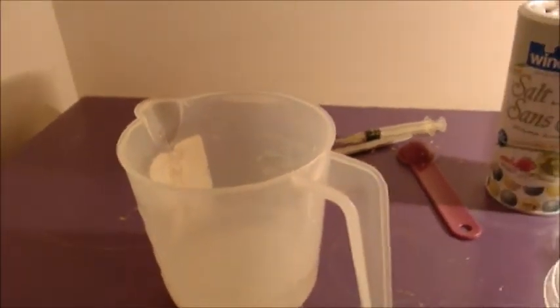I have water here, so first I'll be dissolving the ammonium nitrate into the water, which is 40 grams, and I'll let it dissolve. I'll be back when it's dissolved.